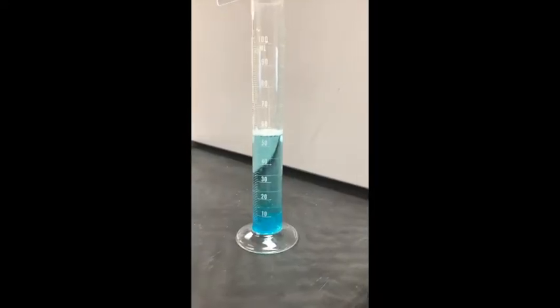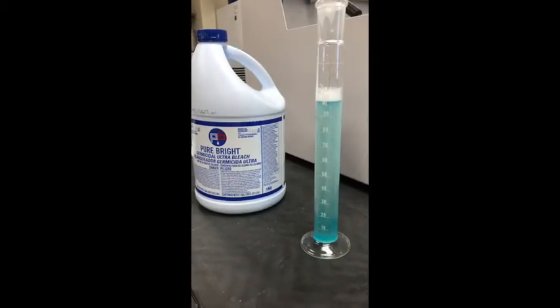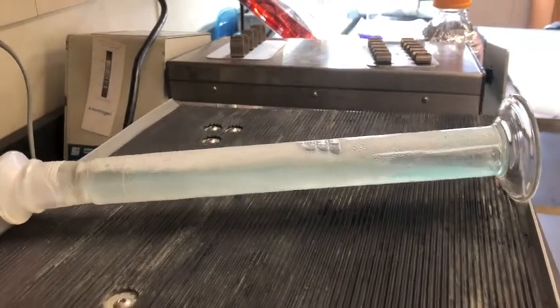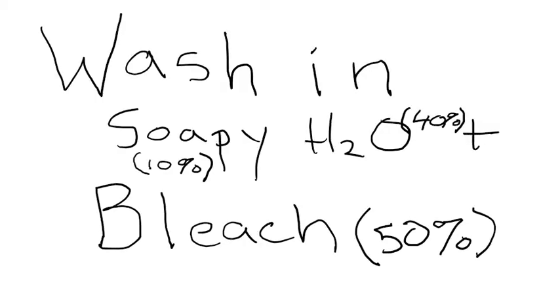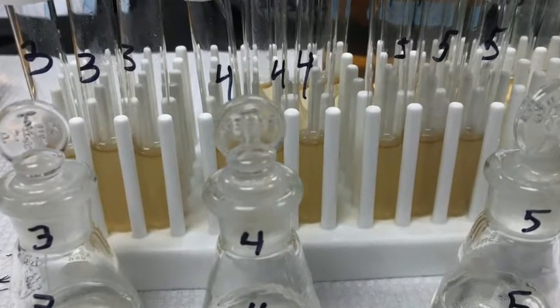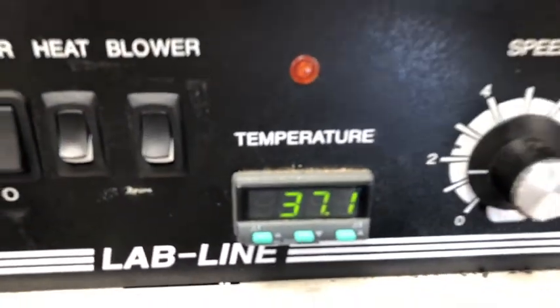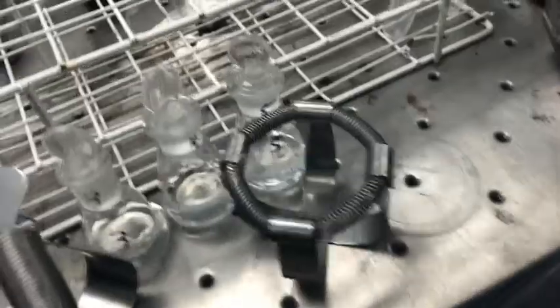So using Dawn liquid detergent, 10 mils or 10%. Bring that up to around 50 mils with water. Then add the rest with bleach. Do a little mixing, a little more mixing. Printed plastic into Erlenmeyer flasks. Put those flasks full of plastic and bleach and soapy water in the shaker for 20 minutes at 37 degrees. Rinse in water.